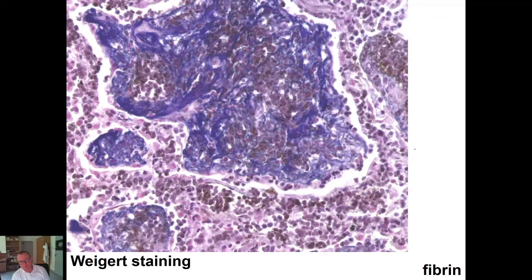No, it isn't a pathological product, but its staining is also used in pathology. Fibrin is a normal physiological product of blood clotting, but blood clotting when found in the tissue is a pathological mark.